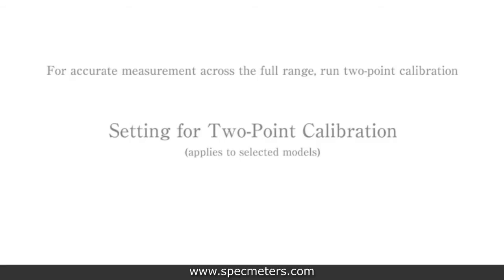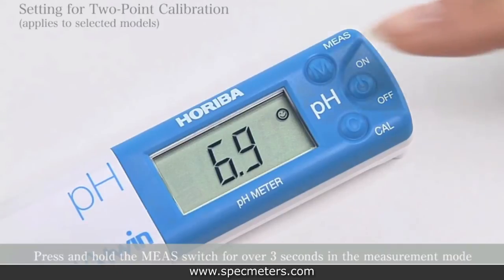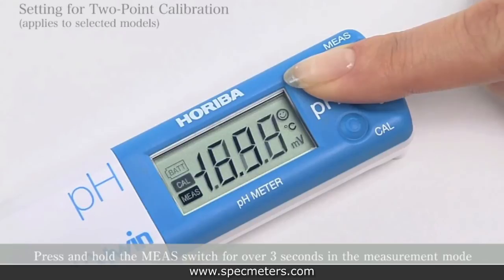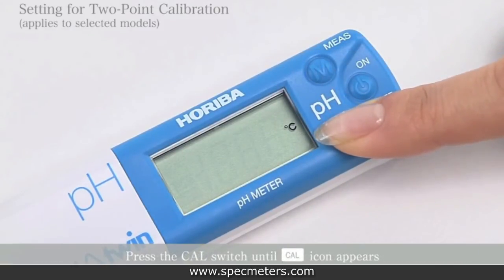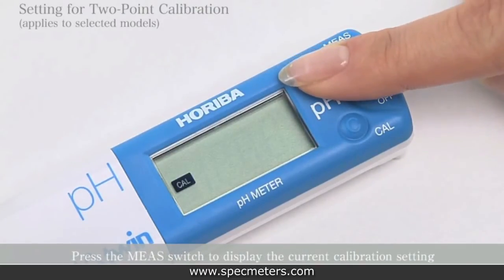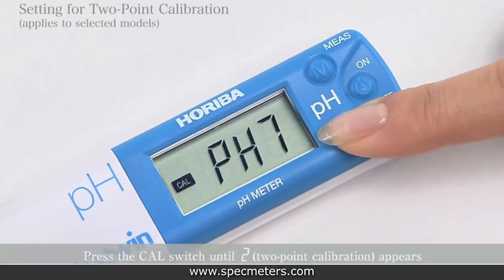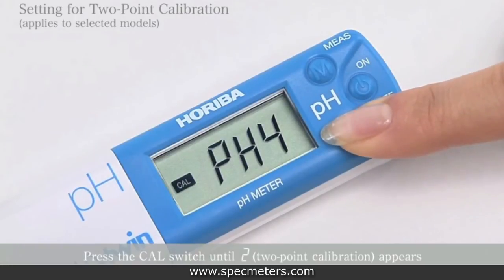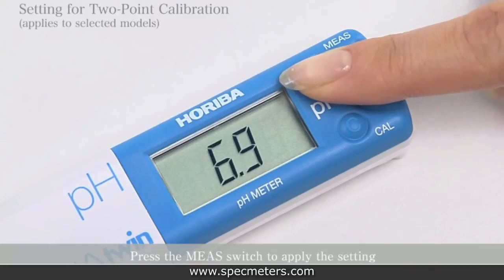Now we'll show you how to adjust the settings for two-point calibration. Make sure the meter is on, then press and hold the measurement switch for over three seconds in measurement mode until the LED options are flashing. Then press and hold the cal switch until the calibration icon appears. Press the measurement switch to display the current calibration setting, then press the cal switch until the two appears.